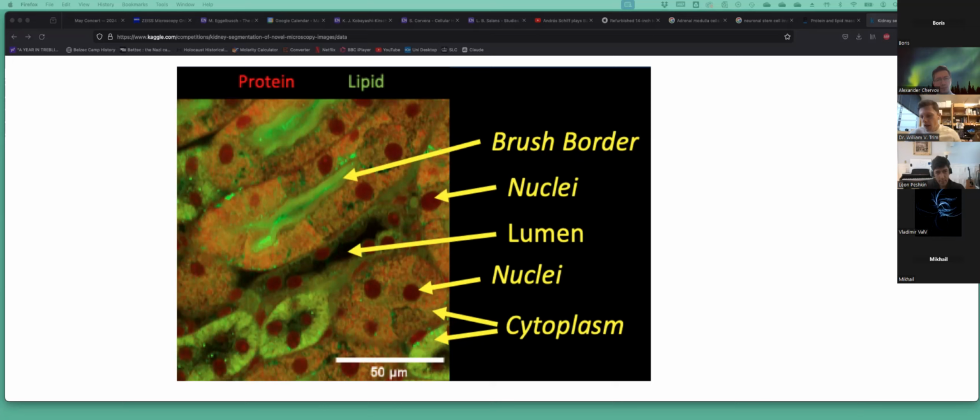I think I know what you're asking. Basically, what we're doing by segmenting regions or biological structures of interest, we have a tool that measures protein and lipid quantitatively with spatial data, which is the only tool of its kind that exists. So we want to use this tool to help make a map of how protein and lipid are distributed among cell types or structures within organs across lifespan. And that will help us understand with much more insight how lipid is implicated in accelerating age or the pathology of age. So that's kind of our end goal, to use this to explain biology.